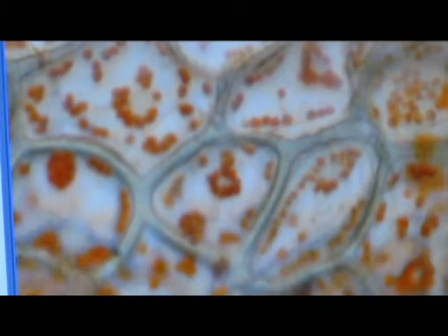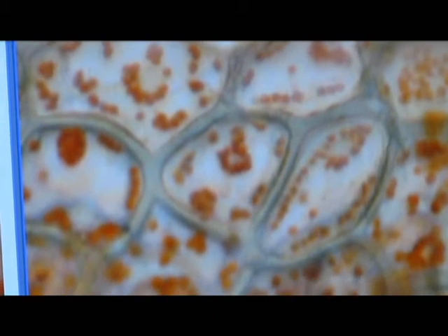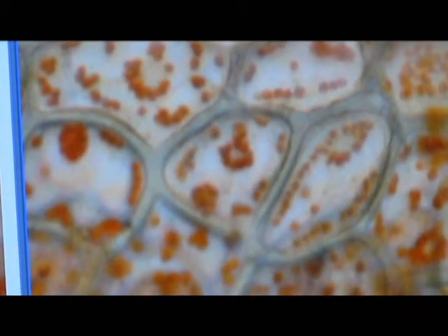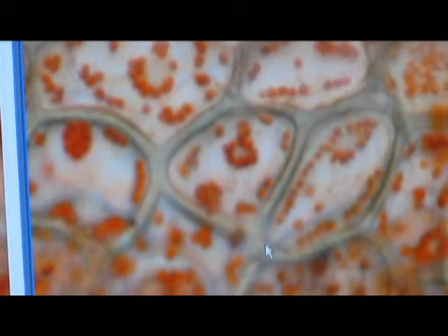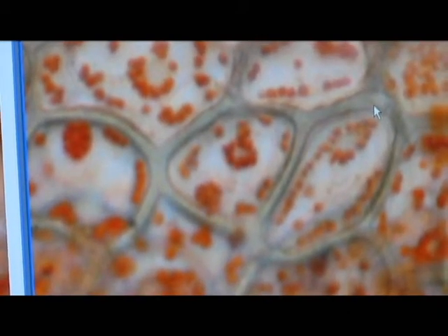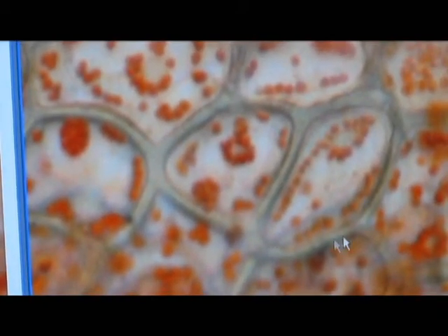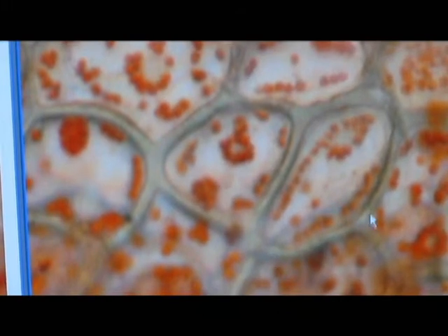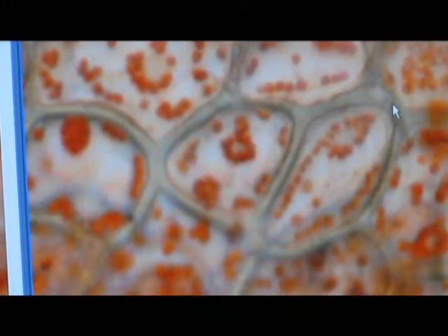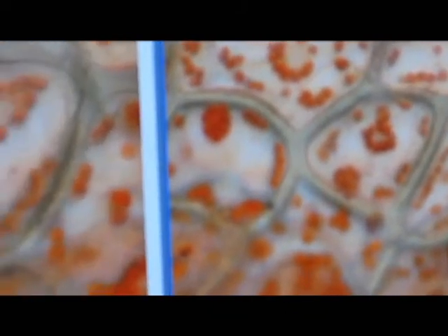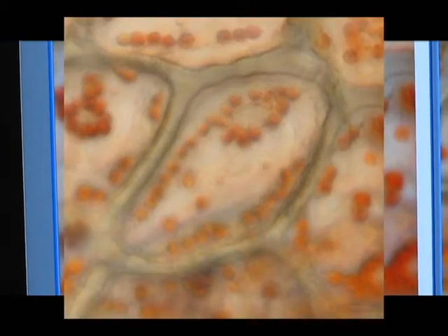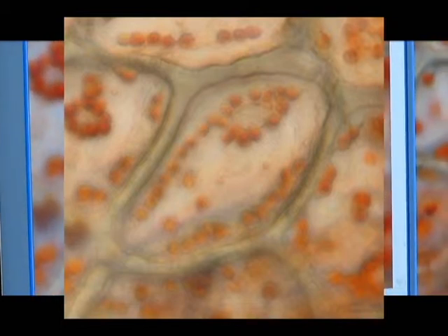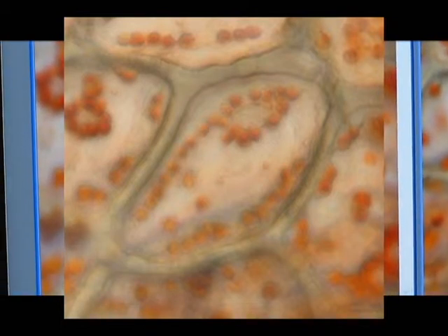On this screen you're looking at a live image of what we're viewing on the microscope with a whole bunch of different red pepper cells. Very thick cell wall because it's from the peel. And this particular red pepper cell is the one that I thought would be fun to model. So I took a photograph of it, and that's shown on the other side of the monitor. We're going to use this particular red pepper cell to model with the dynamic cell model kit.